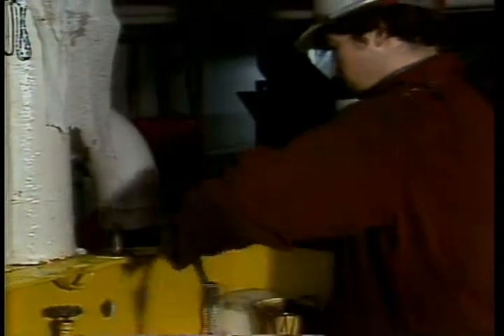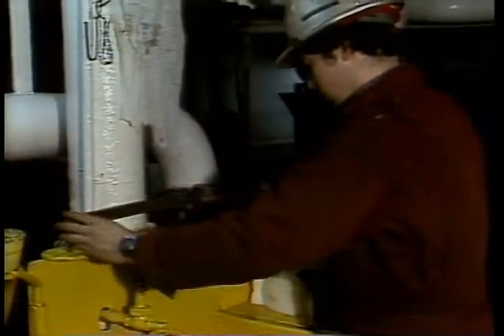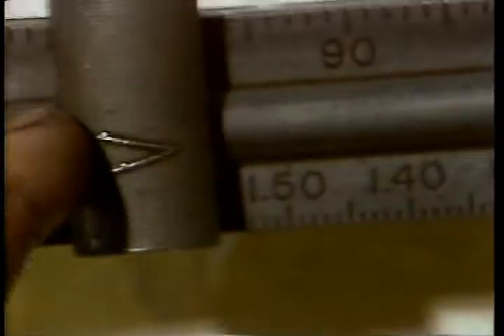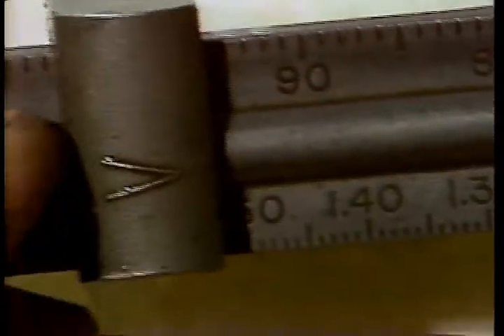Then dry it. Place the balance on the fulcrum. The knife edge fits into the grooved top section of the base on this particular unit. Slide the counterbalance until the bubble in the balance glass is centered.